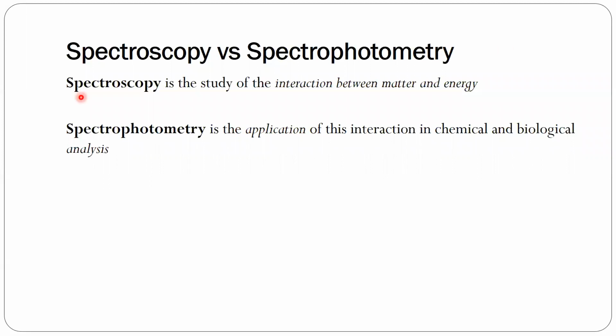And you might hear these two words usually, yung spectroscopy tsaka spectrophotometry. Okay? May pagkakaiba yung dalawang yan. Pag sinabing spectroscopy, so it's the branch of physics that studies the interaction between matter and energy. Okay? While yung spectrophotometry, kaya may suffix siya na metry or metric, it's because in this area, you are measuring something. And that's where spectroscopy comes in.